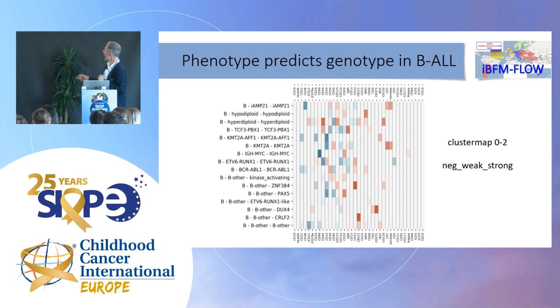I would rather say, okay, let's talk about the zinc finger profile, for example, which is low in CD10, also going into this Pro-B area, or having a strong CD33 signal, for example. Or you go for, where is it? Yeah, t(1;19), for example.